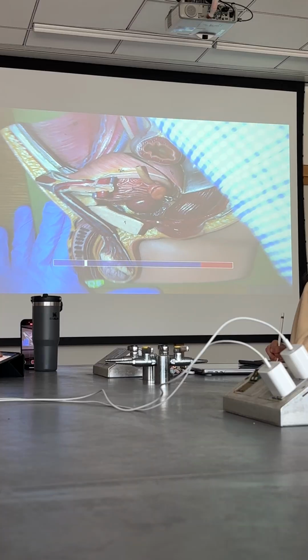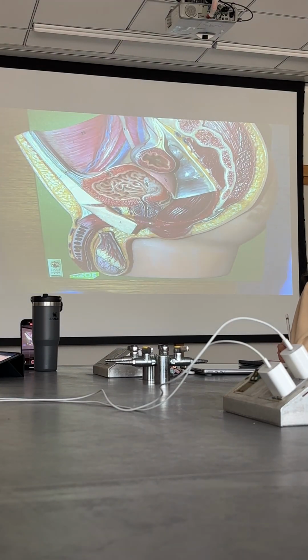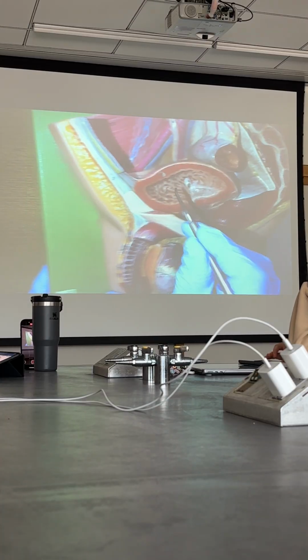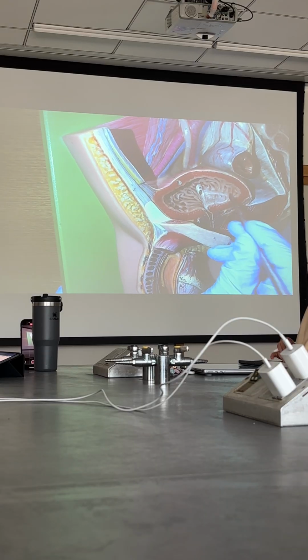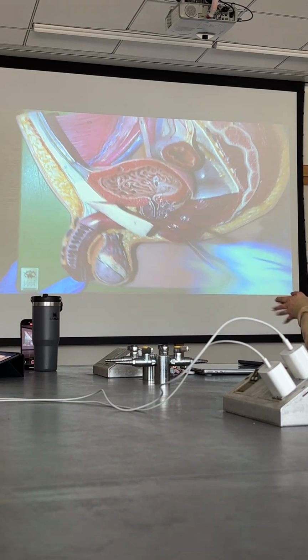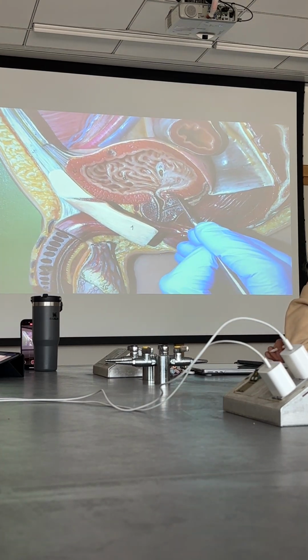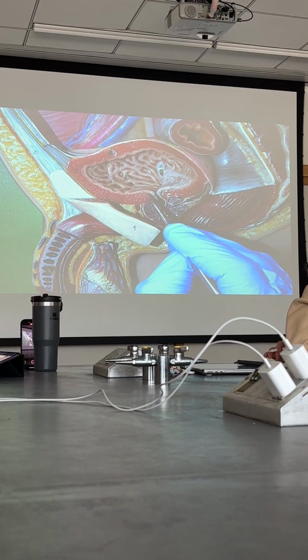Okay, so on this, if you pull this apart and look, just to get your bearings, there's the bladder. That's the opening of one of the ureters there. You can see the trigone area highlighted. That's the opening of the urethra there. There is where the internal urethral sphincter is.